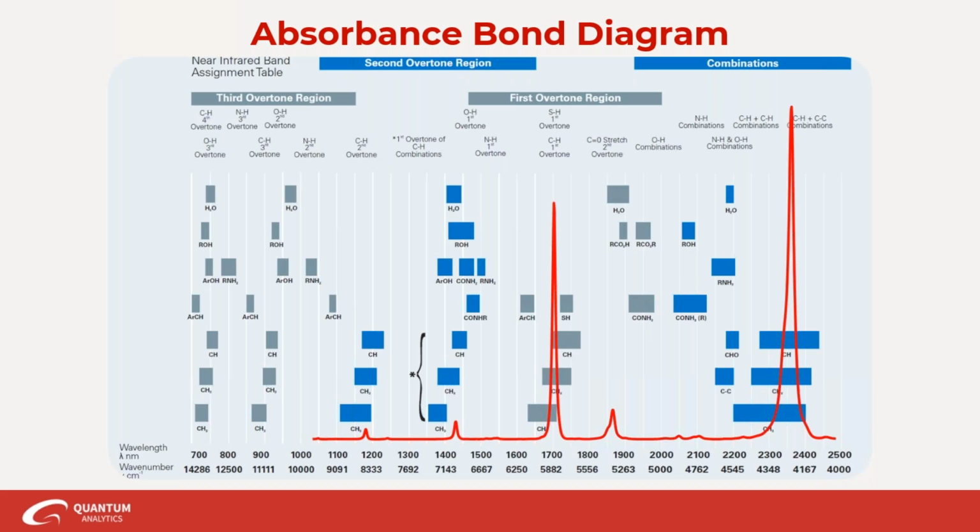And then what's called partial least squares is the most common one, which you would use if you wanted to do a quantitative measurement. There are some different pre-processing methods that you can apply to your spectral data before you do your modeling that could help you out. For example, reducing the noise in your spectra. If your spectra are noisy, there are certain mathematical processes that you can use to reduce that.